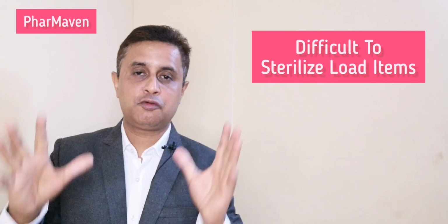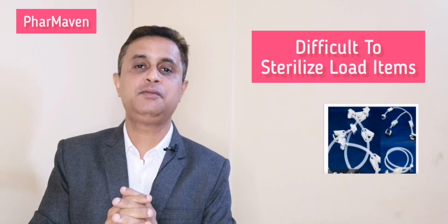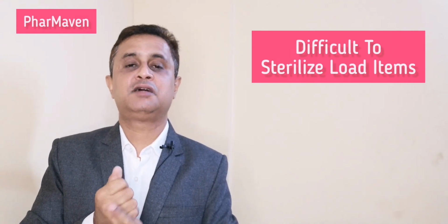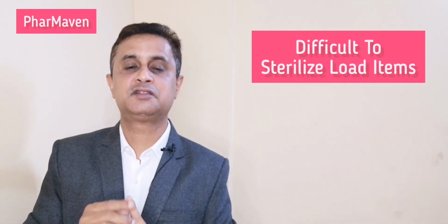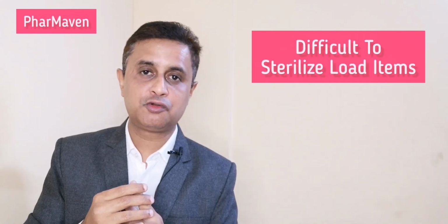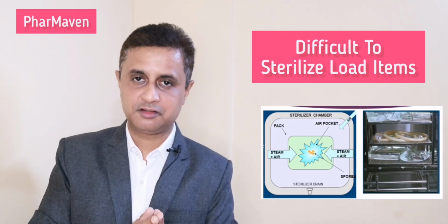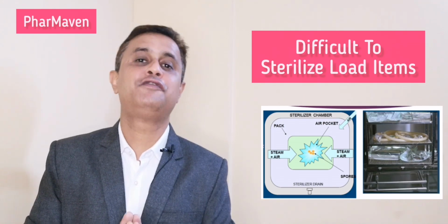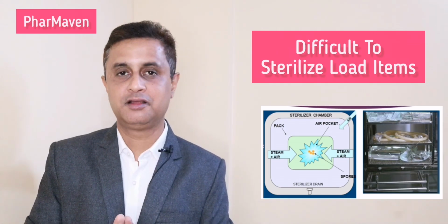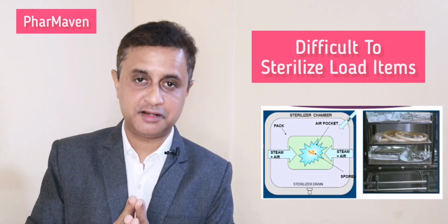Then the next question is, how do you identify that out of my 20, 25 or 30 load items in the load pattern, which items I have to keep thermocouples? This comes from two or three very specific assessments. One is the load item which is most difficult to penetrate by steam. For example, if you have silicone tubings inside a load pattern, your silicone tubing with the longest length may be difficult to penetrate. If you have cartridge filters in your load pattern, then the cartridge filter with a bigger size can be your difficult to penetrate item.